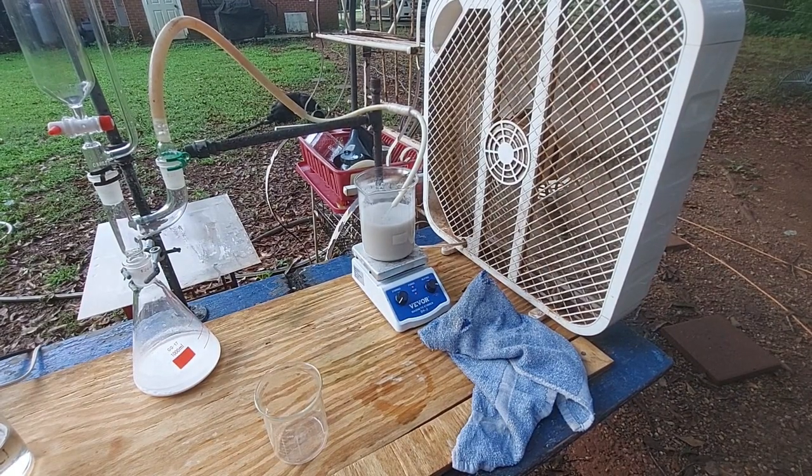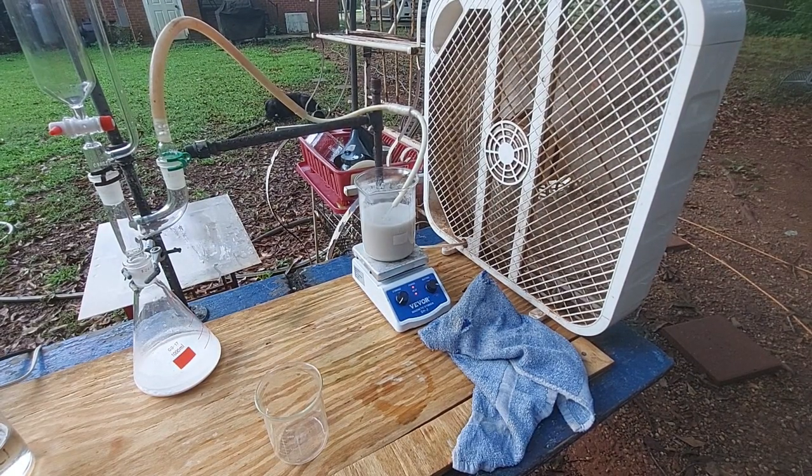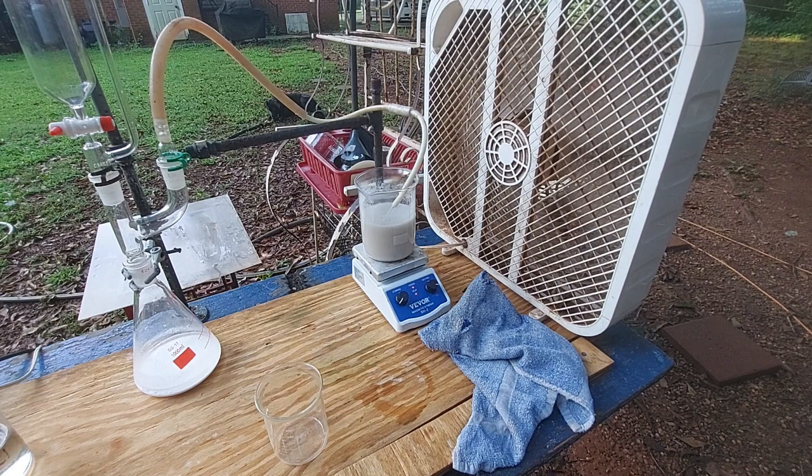We've got our chlorine generator set up. Once this gets hot I'm going to add some hydrochloric acid, because we need HCl in there, and then we'll bubble chlorine gas through it. What that does is create trichloride ion, which oxidizes the mercury, and all of that fairly insoluble mercurous chloride should go into solution.